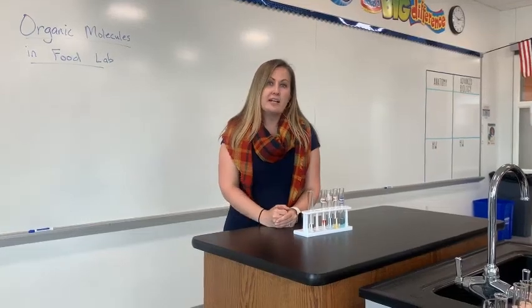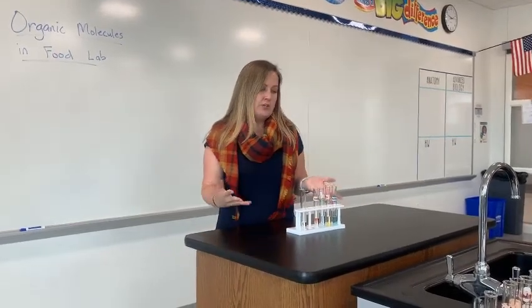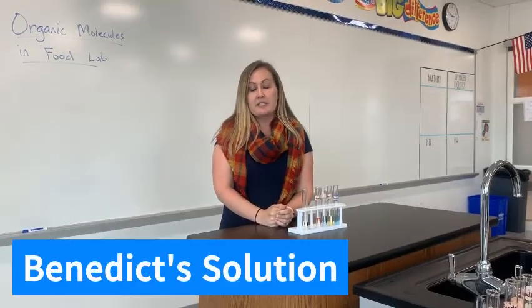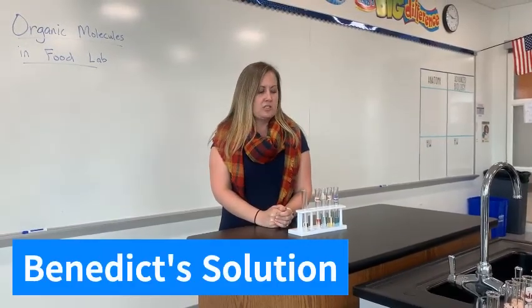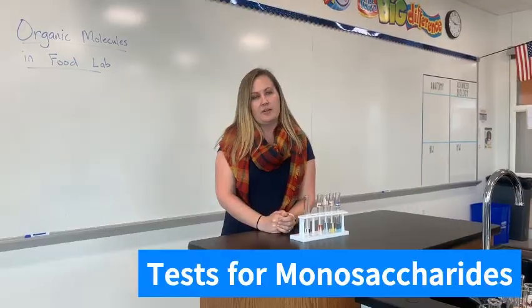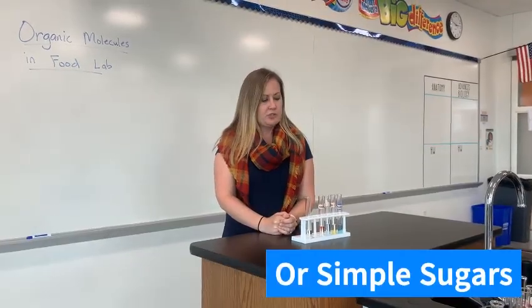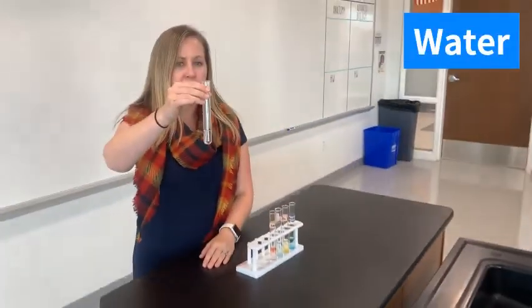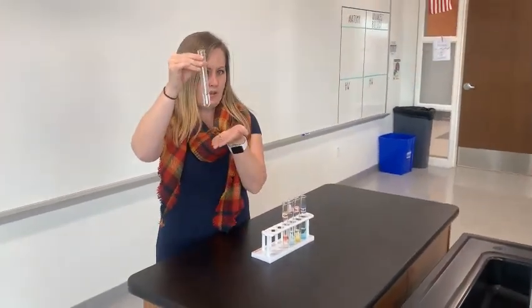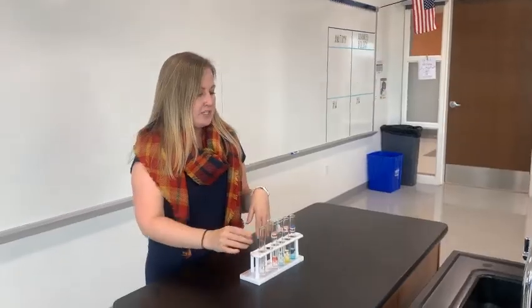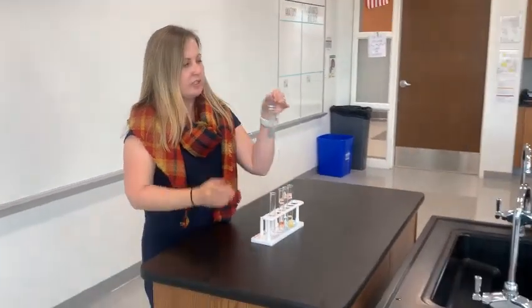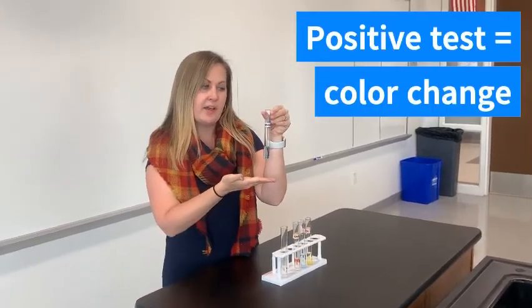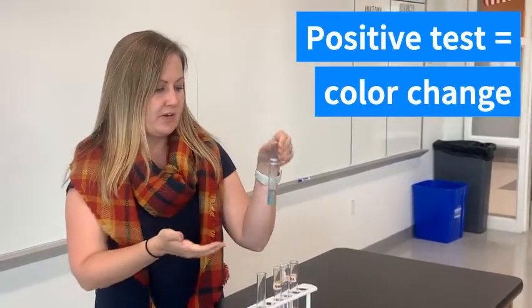In this lab, there are four different tests that we did on different food samples. The first test is called a Benedict solution. What Benedict solution does is it tests for the presence of monosaccharides, which are simple sugars. Right now I have water as our control group. When I add Benedict solution to it, it starts off as blue, and any color change from this indicates the presence of a monosaccharide.